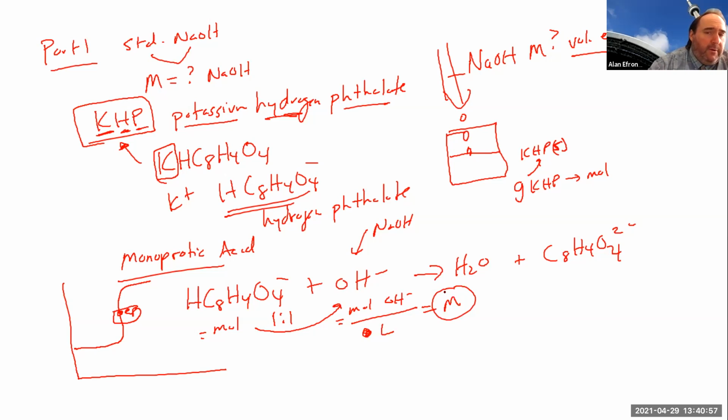So in part one, part of the goal is to figure out the molarity of your sodium hydroxide. We're going to do this by using KHP as our known standard solution. And in part one, the sodium hydroxide is the unknown.